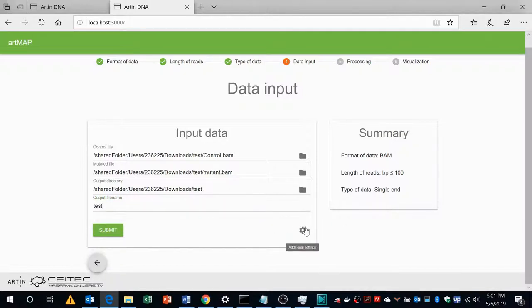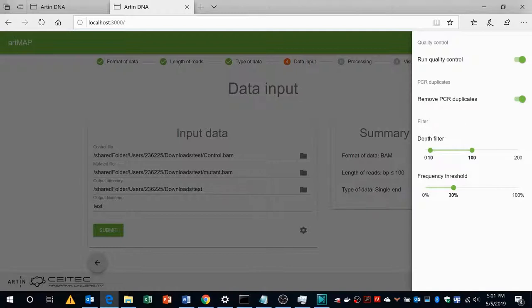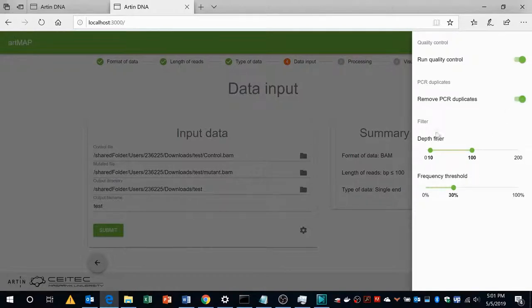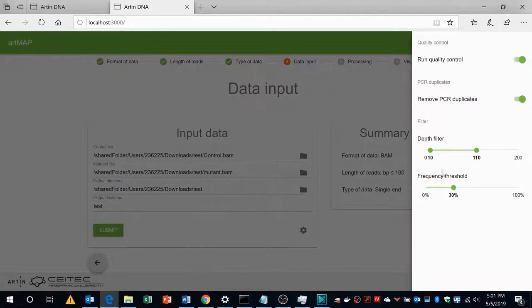There is this additional settings which if you click you can see that you can turn on and off the quality control as well as PCR removal step. You can turn on and turn off by clicking it. You can also change the filter of the sequencing by sliding it. You can also change the threshold frequency by sliding it, but the default parameters work very well.